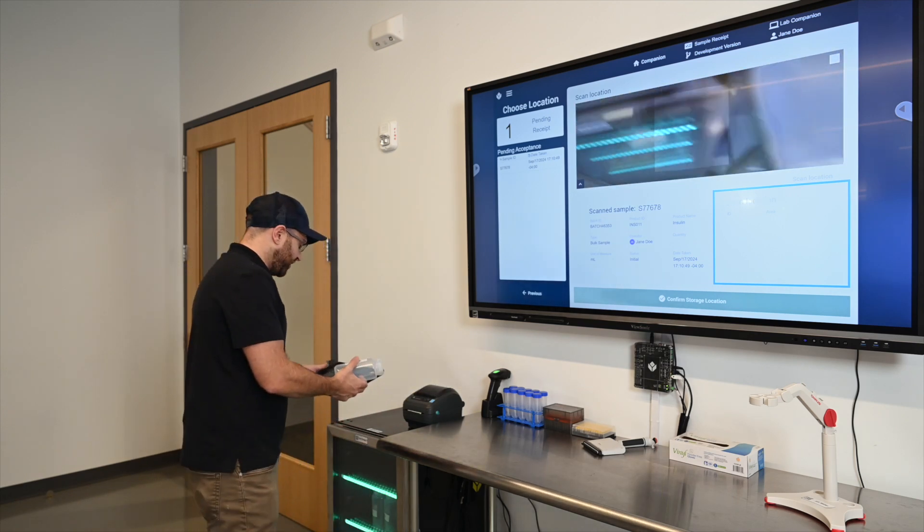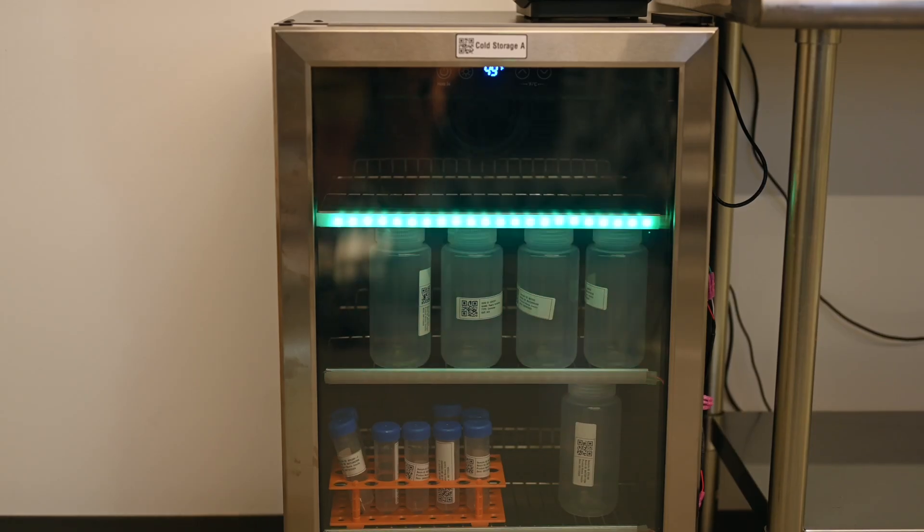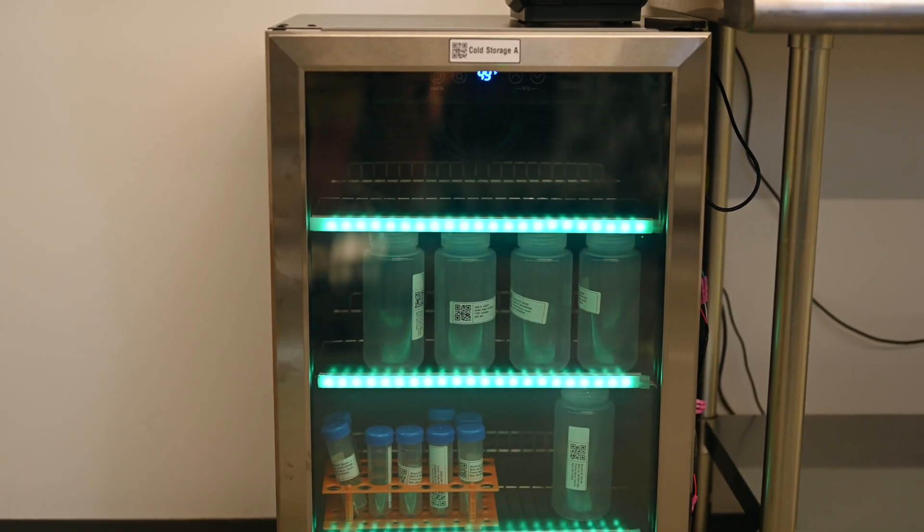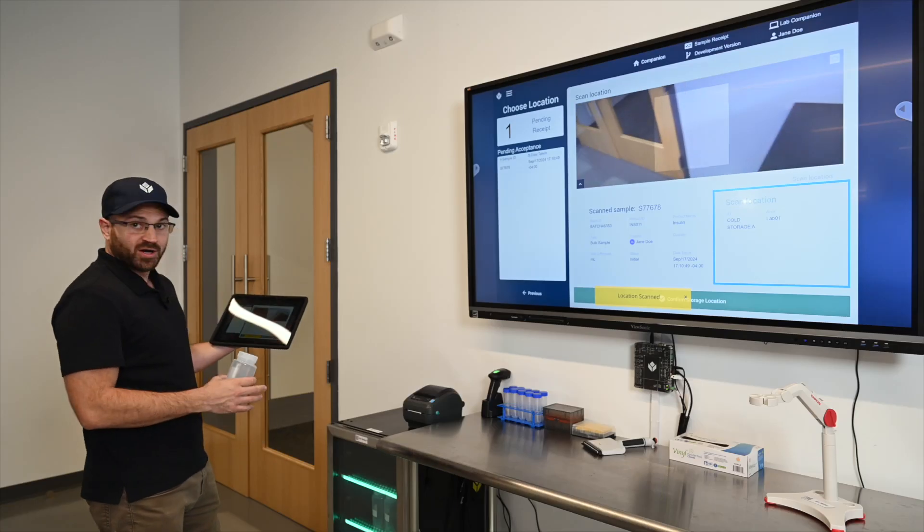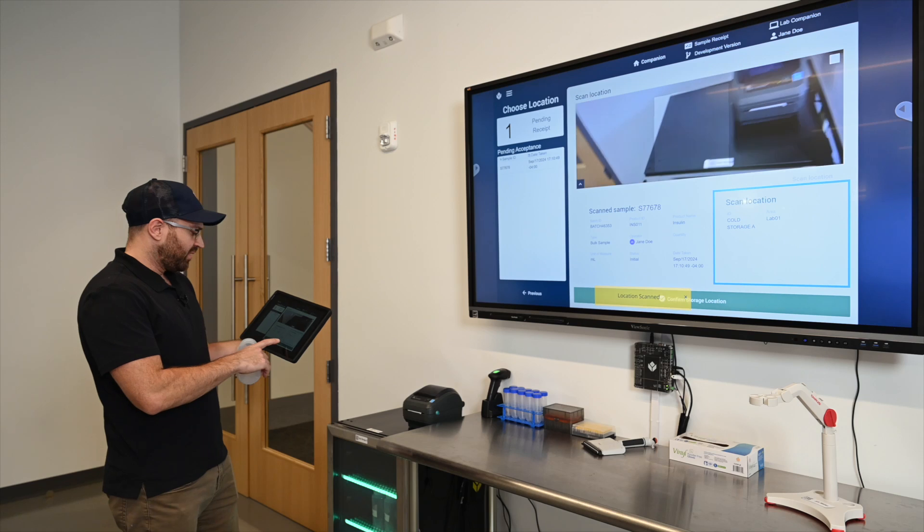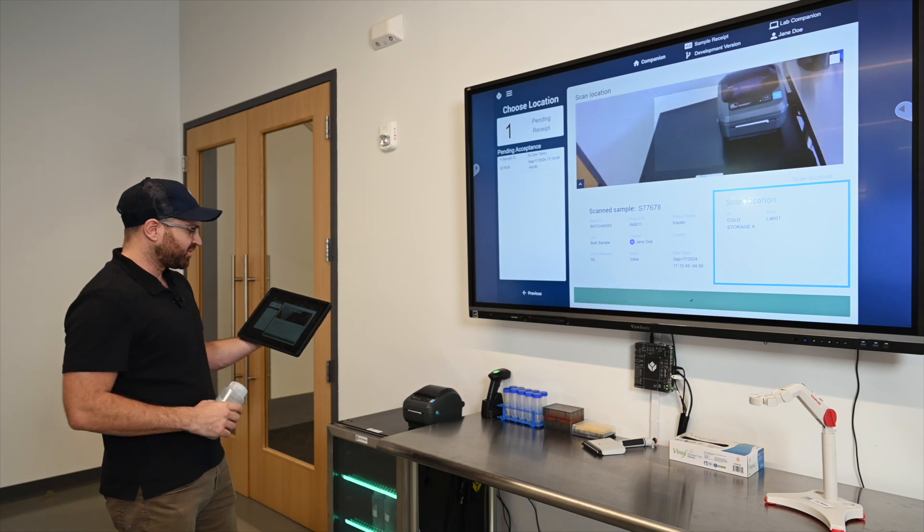We're going to put it in the fridge so that the lab analysts know it's ready to begin processing. The fridge is lighting up to tell me where I should put it and I'll confirm that storage location.